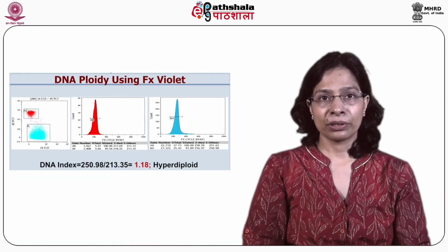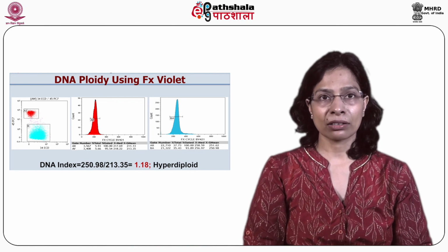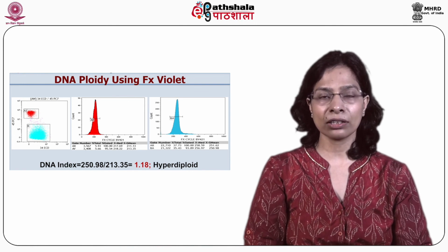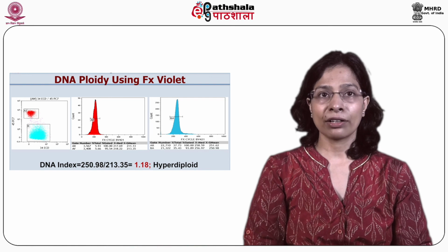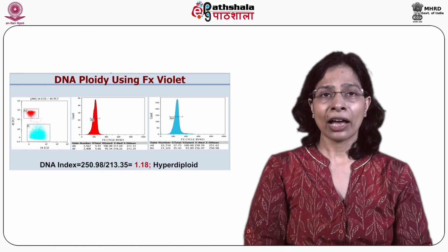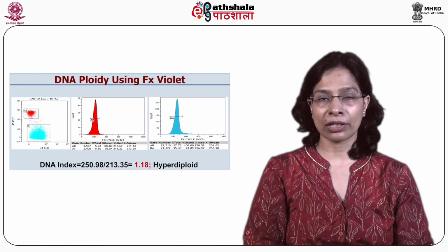In this example, from a case with acute lymphoblastic leukemia, the blasts have been gated using the differential expression of two antigens, that is CD45 and CD34. The aqua color events are 34 positive and are dim to negative for CD45, the blast population, and the CD45 bright 34 negative red population are the mature lymphocytes.